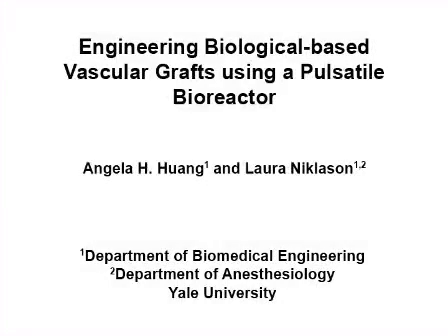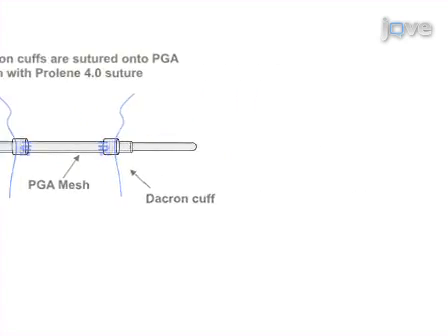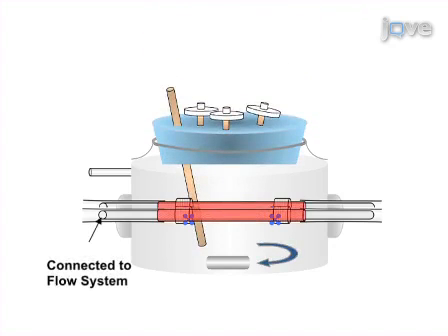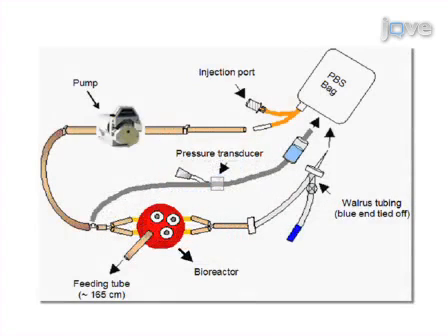The overall goal of this procedure is to engineer biological-based vascular grafts using a pulsatile bioreactor system. This is accomplished by preparing a biodegradable scaffold from PGA mesh where the cells will grow and assembling them in a bioreactor chamber. The scaffolds are then seeded with smooth muscle cells and a lid with air and feeding tube seals the bioreactor chamber. The bioreactor is then connected to a flow system to provide pulsatile flow to vessels in the bioreactor.